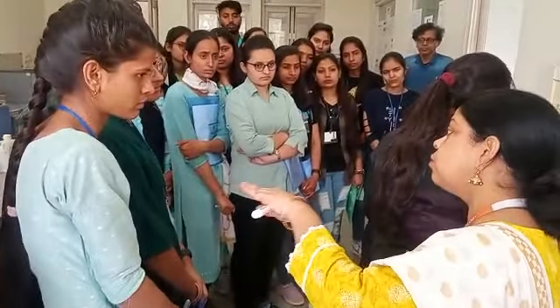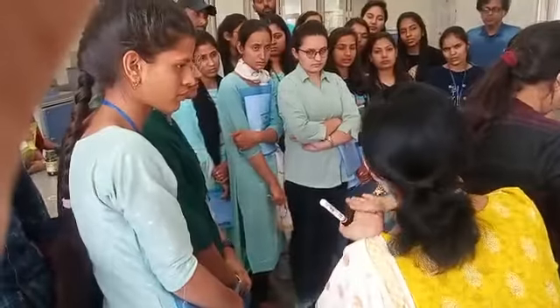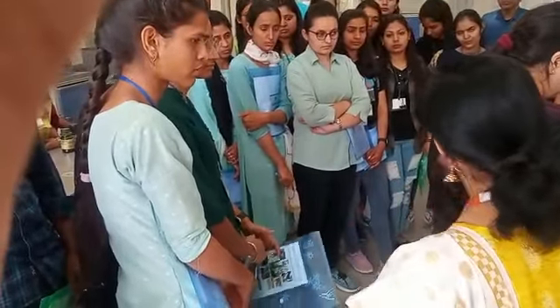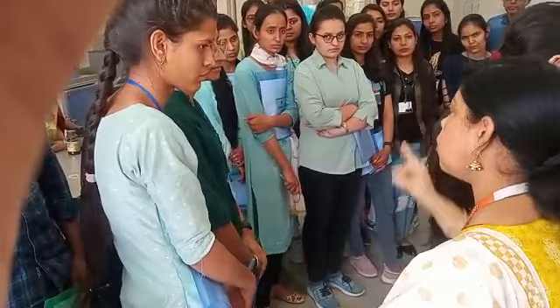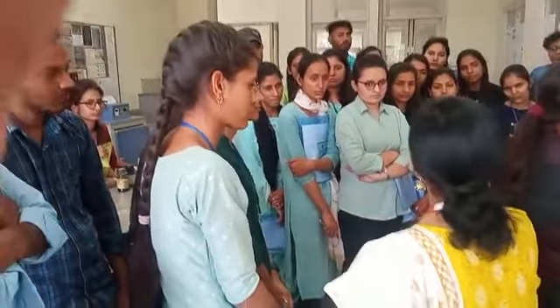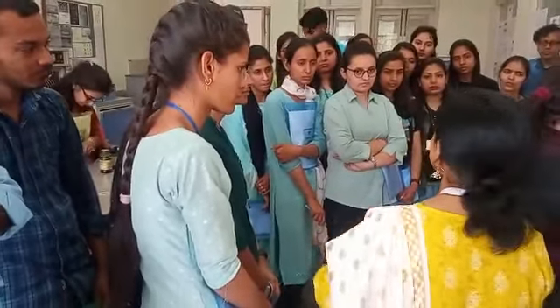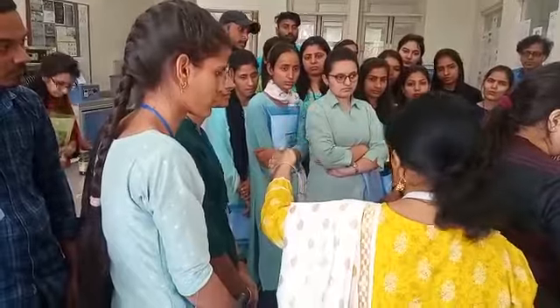TLC plate क्या होती है बच्चों? ग्लास प्लेट पर हम सिलिका जेल की थिन लेयर लगाते हैं. This is called TLC plate. Okay, and you have to put spots on this. Okay, then after this, the fourth spot is of your product. Okay, by this you can check the progress of reaction.